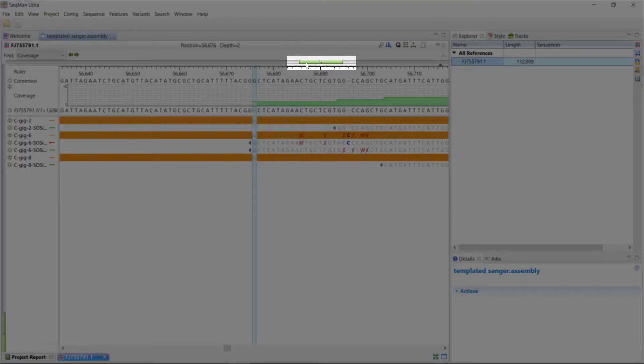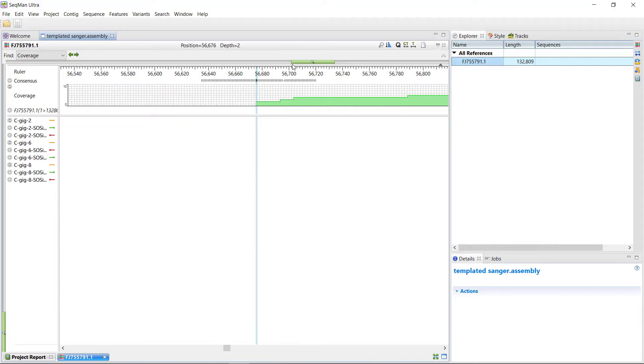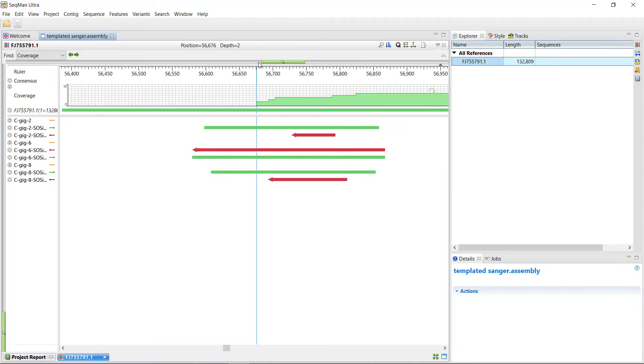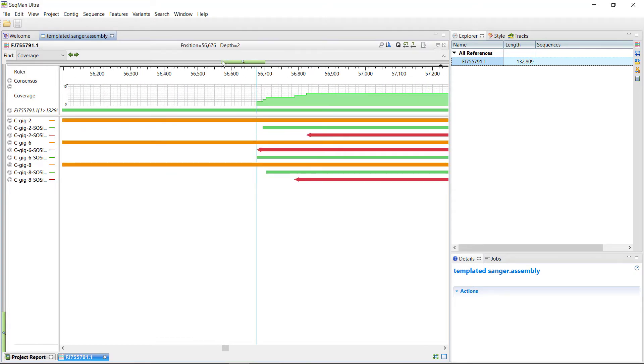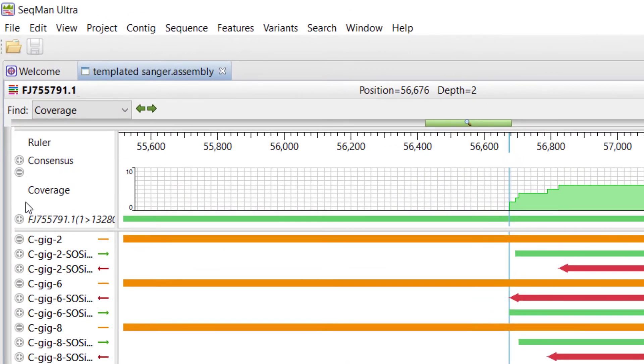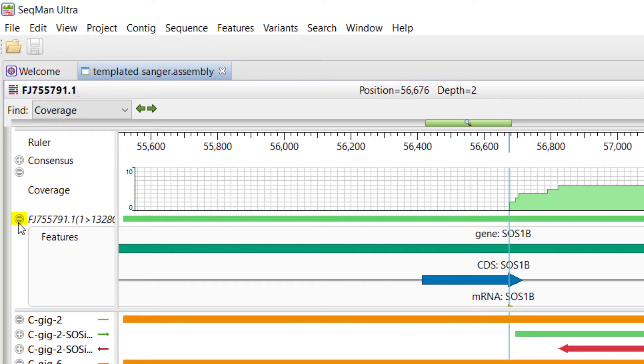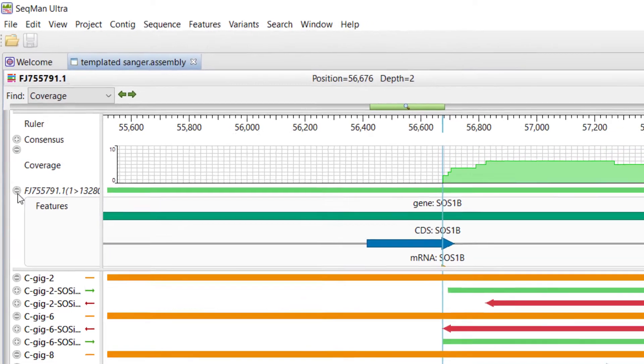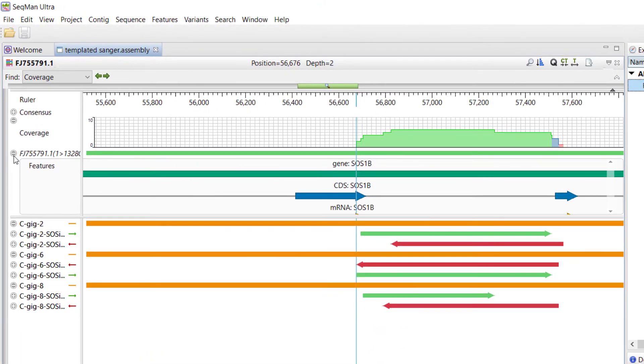The green slider at the top also allows you to zoom in and out. When I expand the reference sequence at the top by clicking the plus sign next to it, I can see features from the GenBank file, and also see I have sequencing coverage in the intron region of the SOS1B gene.